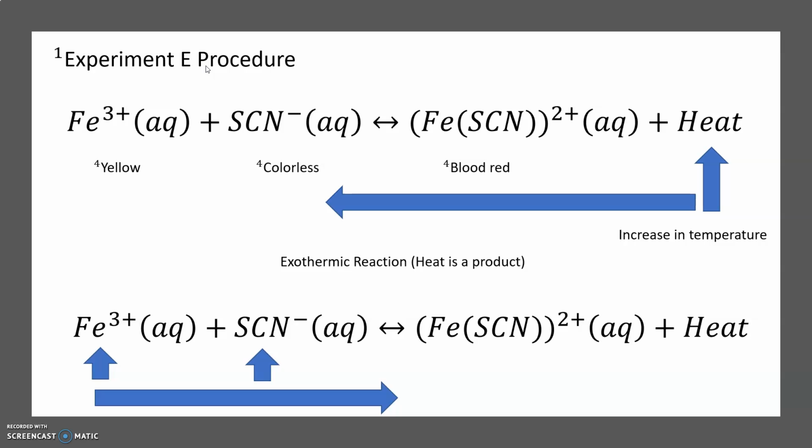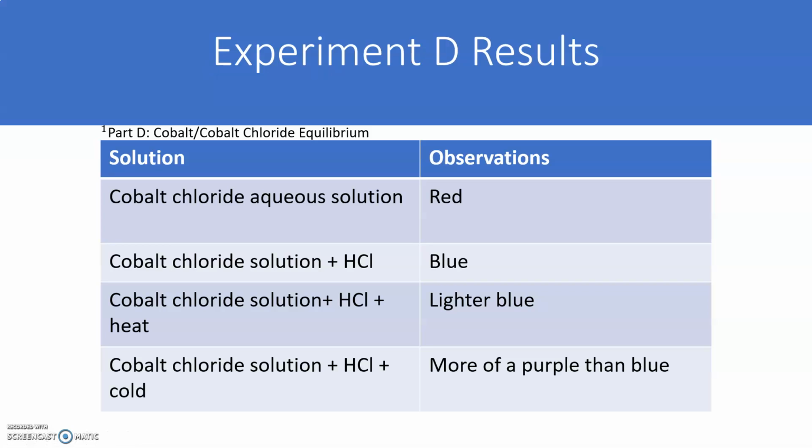This slide exhibits the observations made in Experiment D.